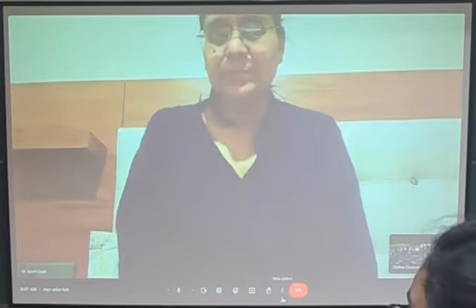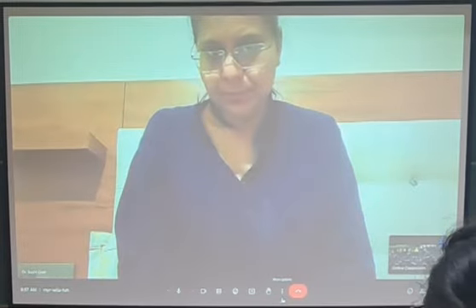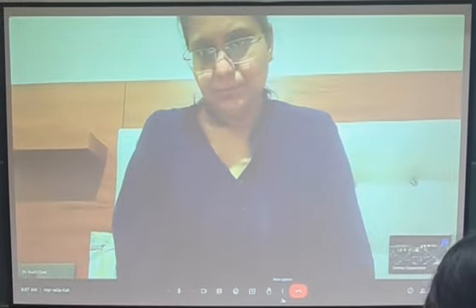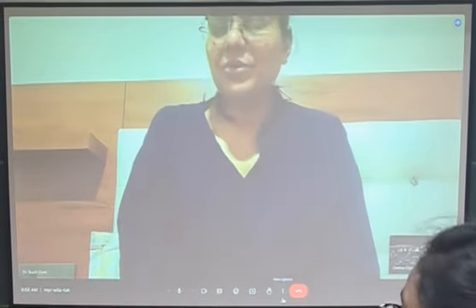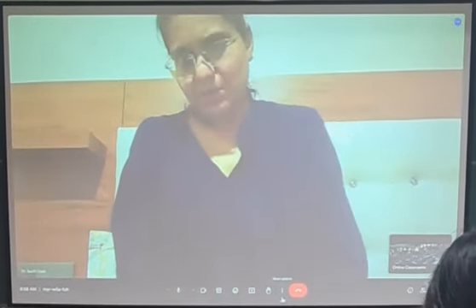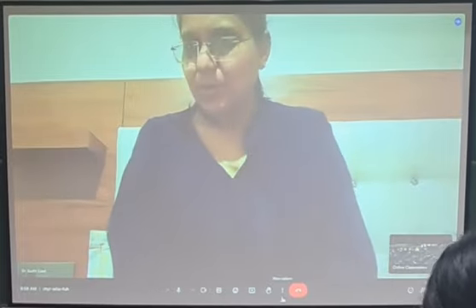If we have another sample where we know the number of CFU in that given sample, could we standardize with respect to that and then directly compare the OD value? You can do that, but in real time you don't want to have a standard, isn't it? Although you're right, I'm not saying you're wrong, but you have chosen a difficult method. There could be an easy method also.